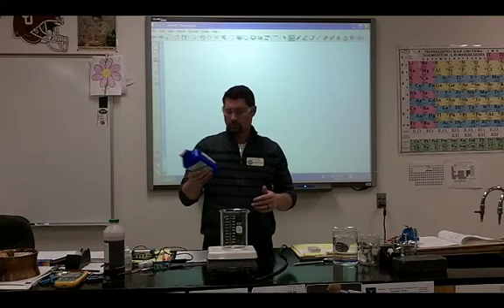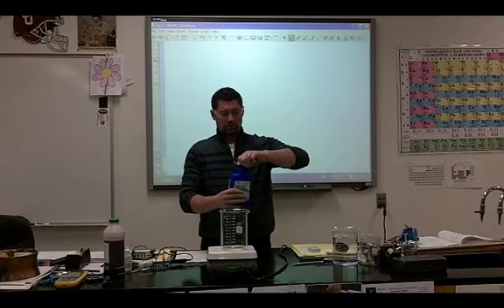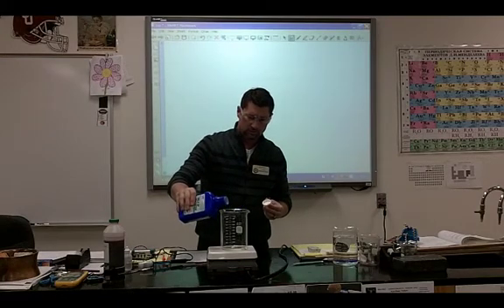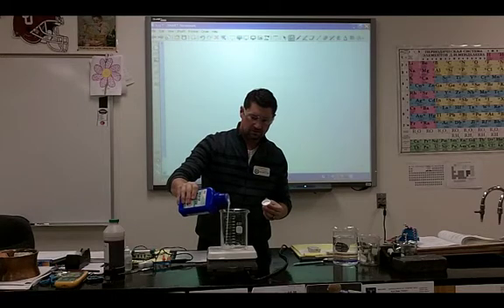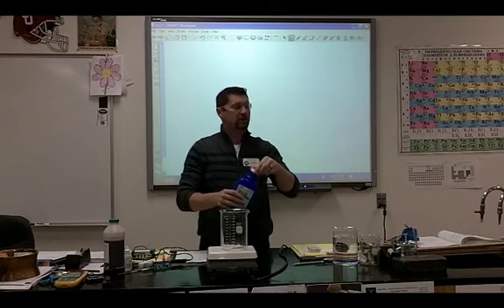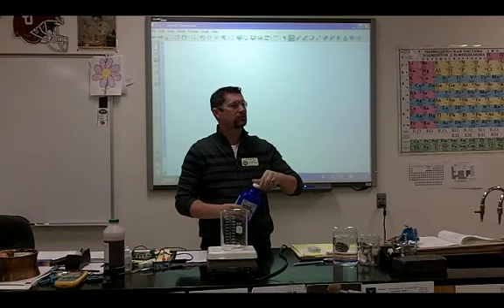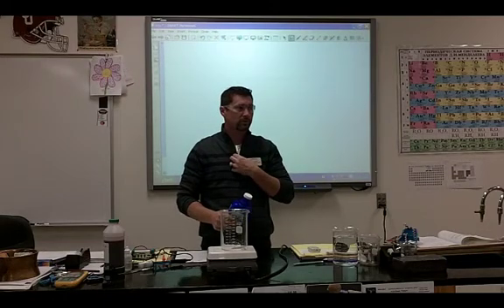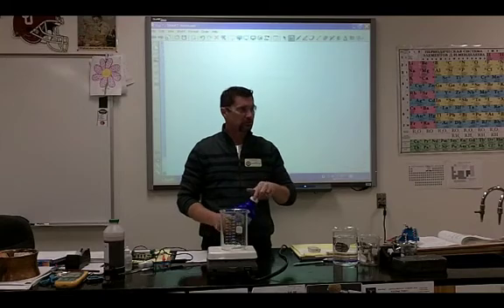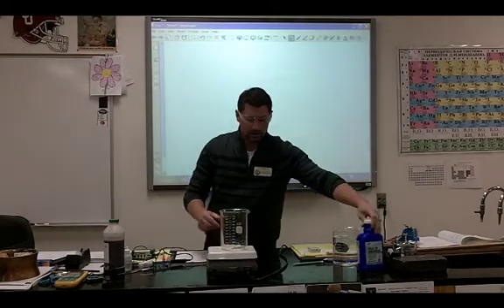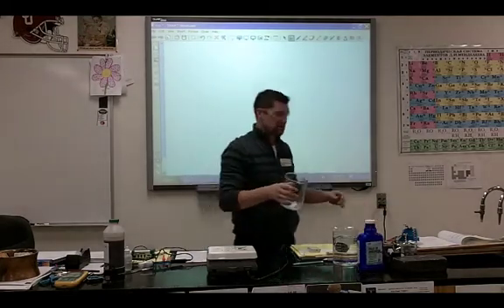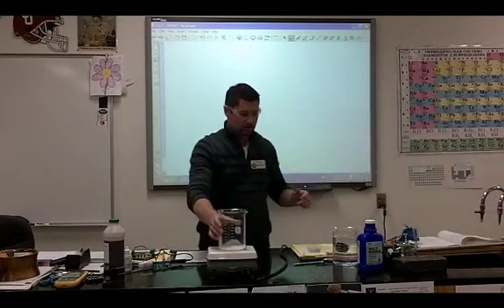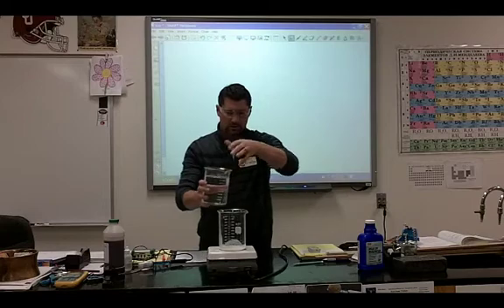Magnesium hydroxide. So I'm going to pour just a little bit of it in here. If you've got a tummy ache, if you have too much acid built up in your tummy or in your esophagus, if you have heartburn, this is a base that's going to soothe it. It's disgusting looking, isn't it? So I'm going to add some water to it, water it down.